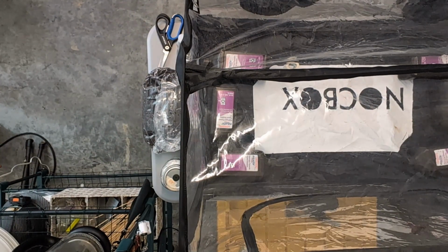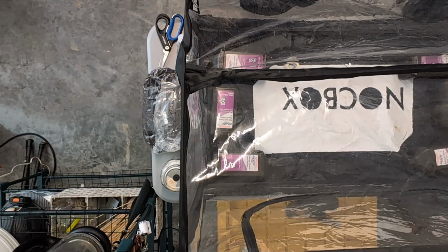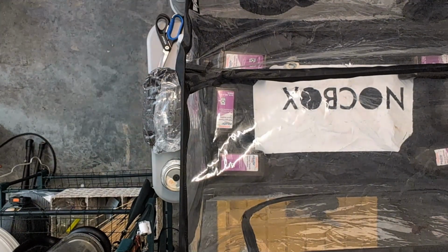Before you put anything in the still air box, you're going to want to sanitize it. So make sure you have gloves. And I have done a little bit of research about short sleeves versus long sleeves for once you're inside the air box, and the general consensus I have found is to go no sleeves. Just have your bare skin, you know what I mean.